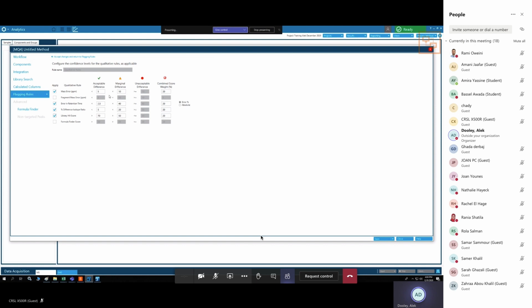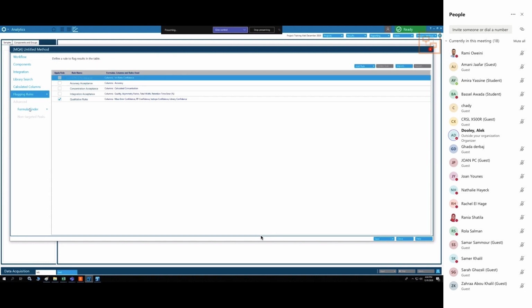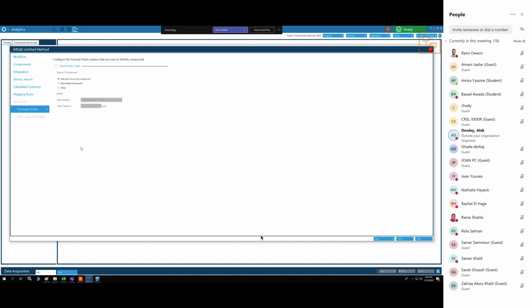Select the same things. Now I have to remember my settings, right? I put 3 and 7. And retention time I put 0.2, I think, 0.4, and I changed it to absolute. And I put 30, and moderating square I left alone. And accept.